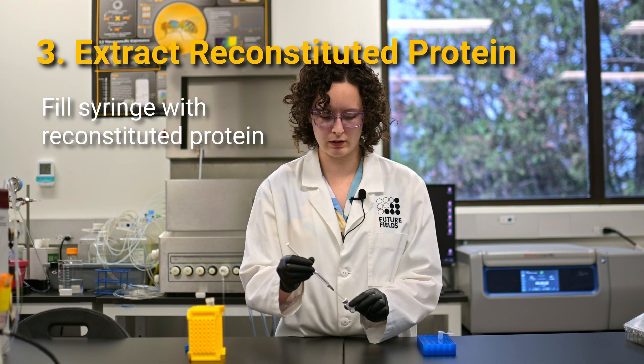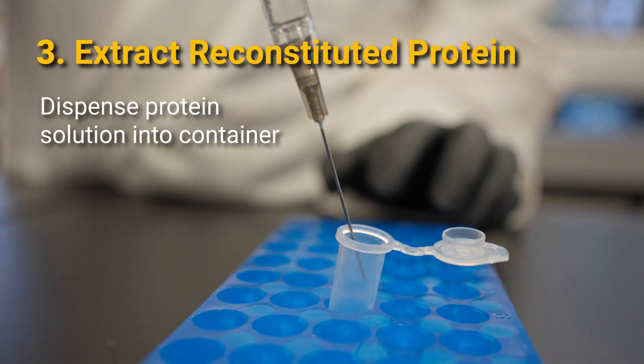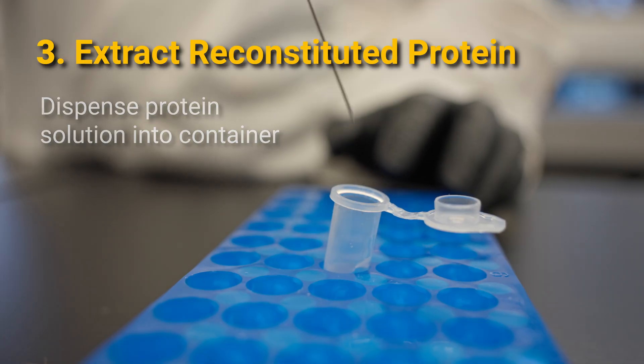Remove the needle, and then dispense the protein into whatever container you want it to be in. And that's it.